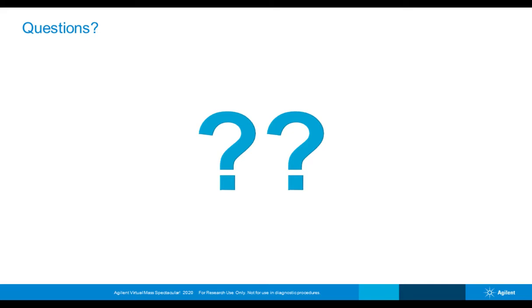Okay, all right, great. One more for you, Dr. Sartain. With data acquisition, can you do blank subtraction with your iterative MS-MS?